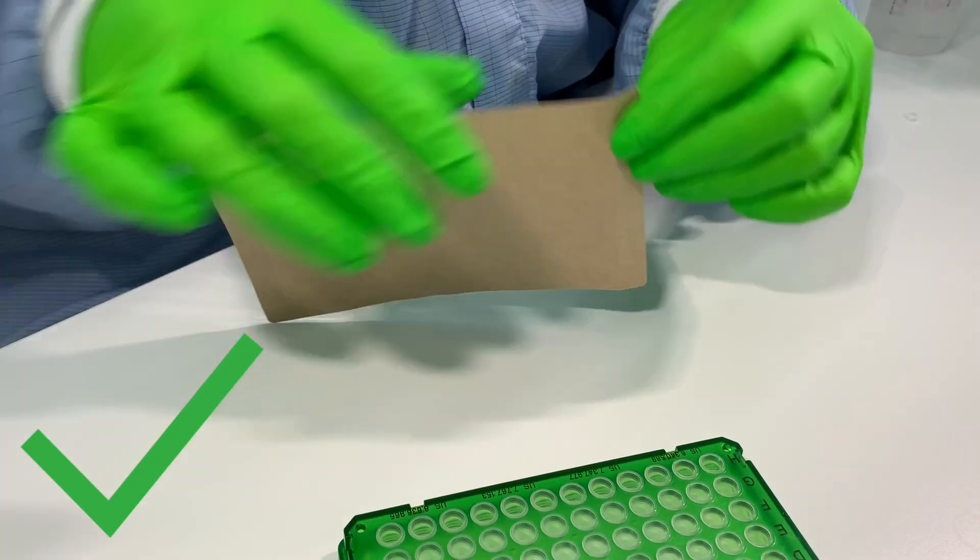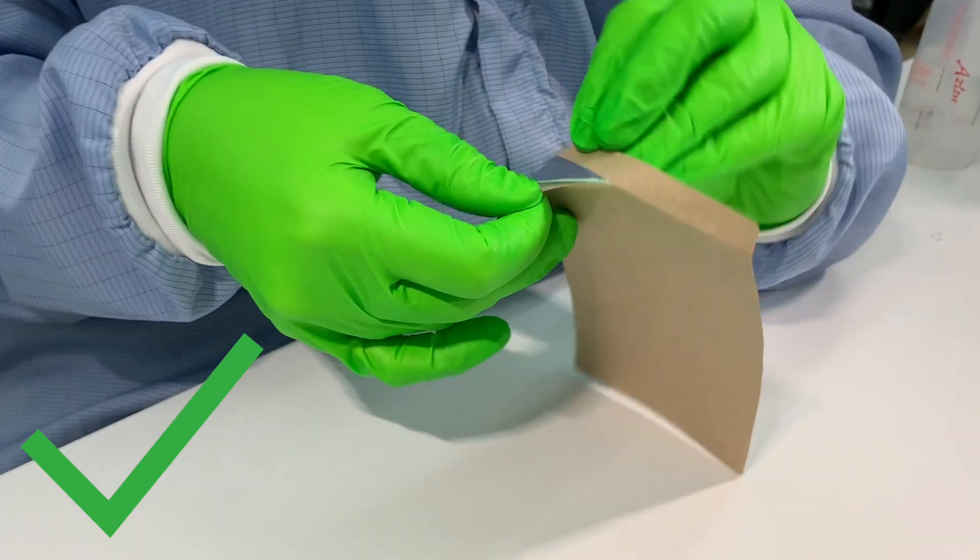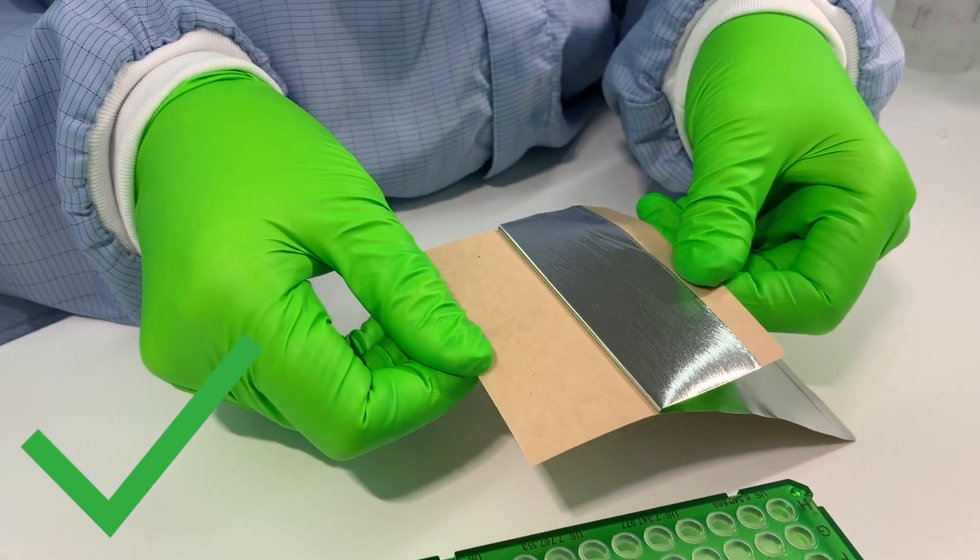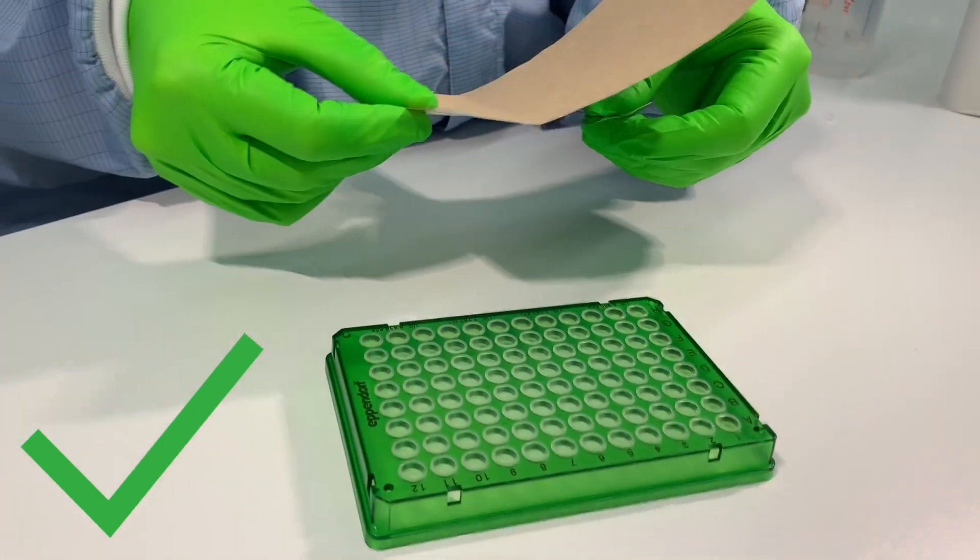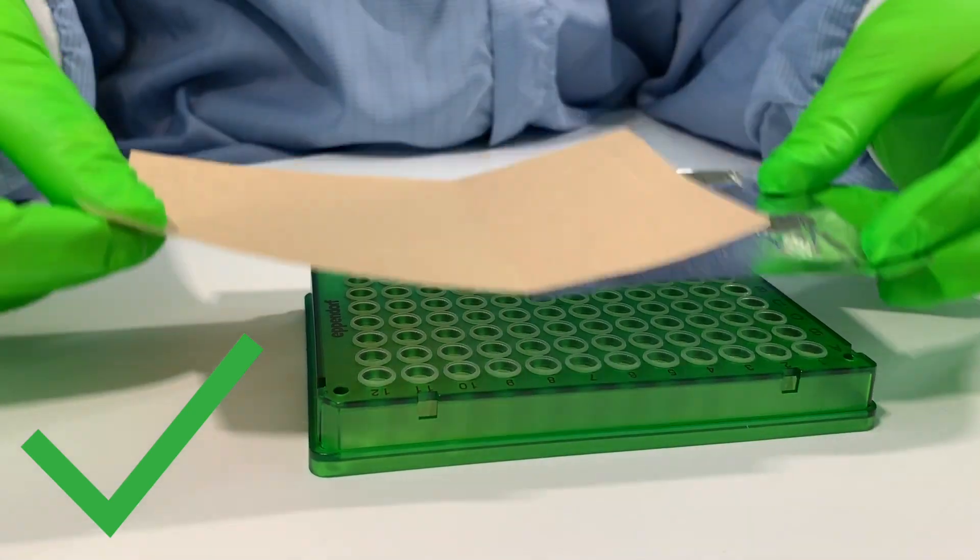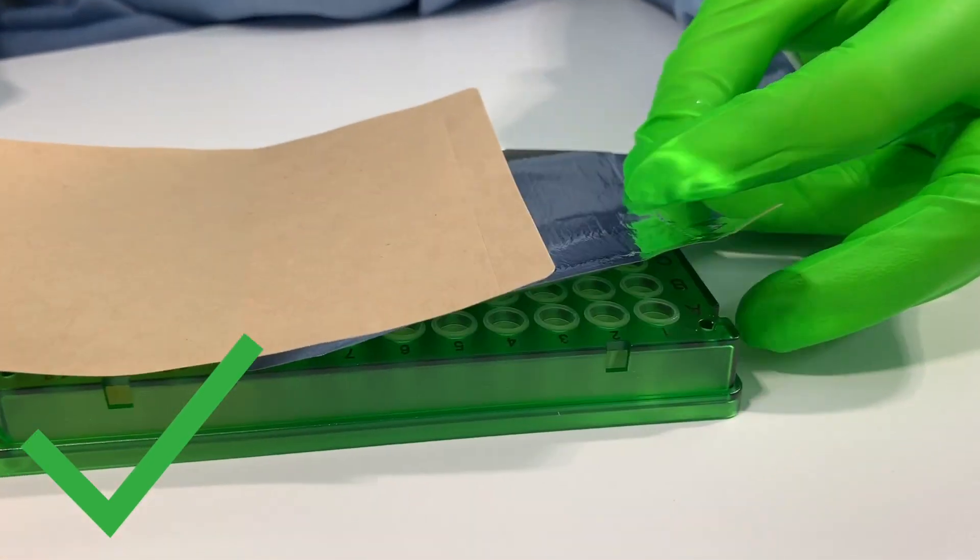Not every lab has a plate sealer. However, there is an easy way to seal a plate using the protective paper. As before, pull away the protective paper about two thirds without touching the sticky side. Place the seal with the perforation located along the edge of the plate, press down on the seal and pull the protective paper over the other edge of the plate.